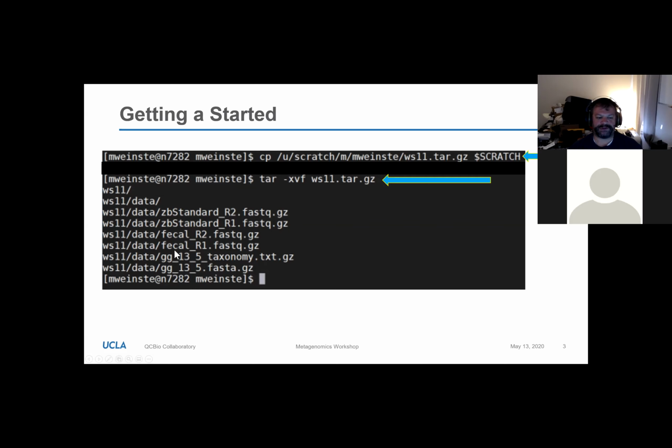I actually changed around the data quite a bit. With the new class data, you're getting a little computer program in there to help, and you're also going to be getting a different 16S database. So go ahead and run these. I will check back with you in about a minute and see how everything went.